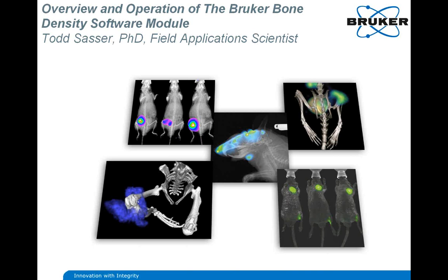Thank you, Meryl. Again, we'll be presenting the Bruker Bone Density Software module. This presentation is intended to serve as a somewhat quick start guide to the Bruker Bone Density Software module. We will also provide an overview of the X-ray imaging capabilities of the Bruker In-Vivo imaging systems as well.